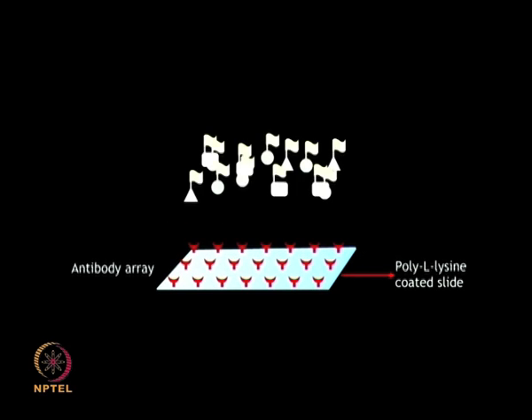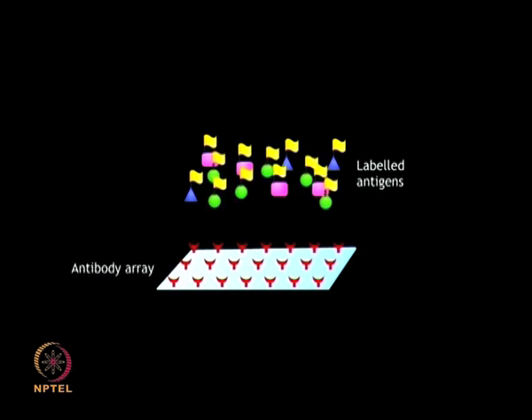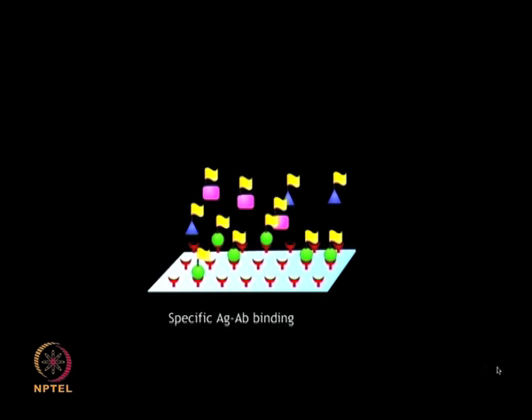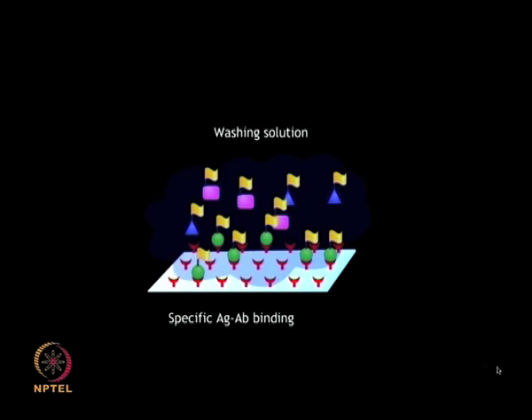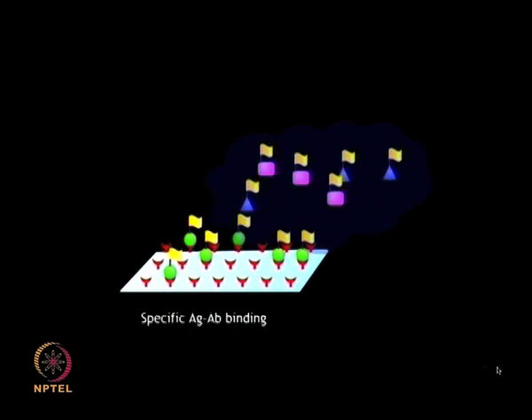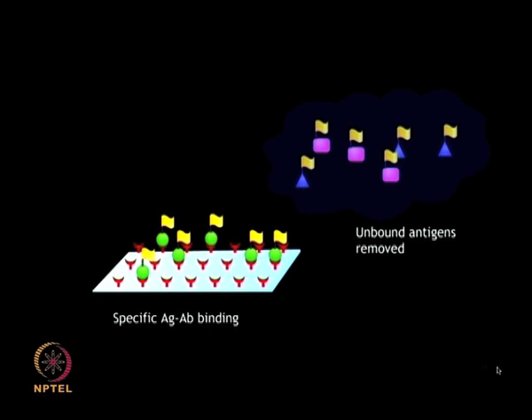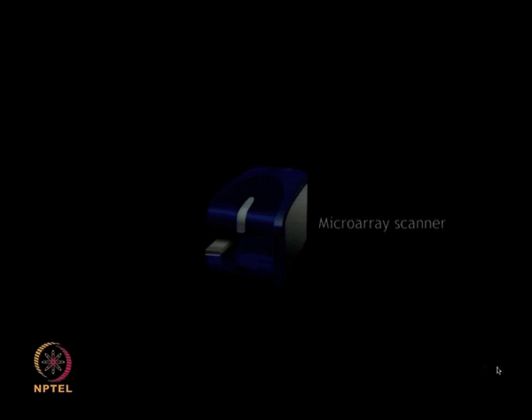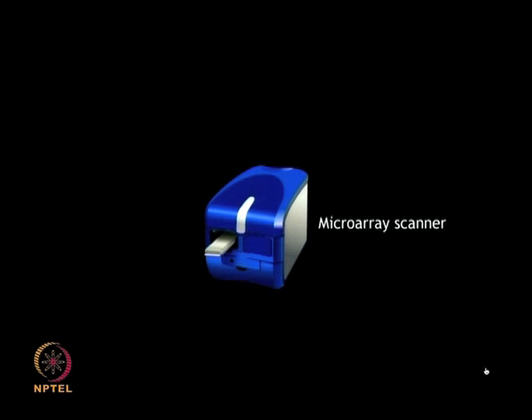In this study, Haab et al. used protein microarrays for highly parallel detection and quantitation of specific proteins and antibodies in complex solutions. Authors printed 6 arrays of 114 different antibodies onto poly-L-lysine coated glass slides by using a robotic microarrayer. These arrays were used to analyze the interactions in 6 unique antigen mixtures ranging in concentrations from 1.6 microgram per ml to 1.6 nanogram per ml.